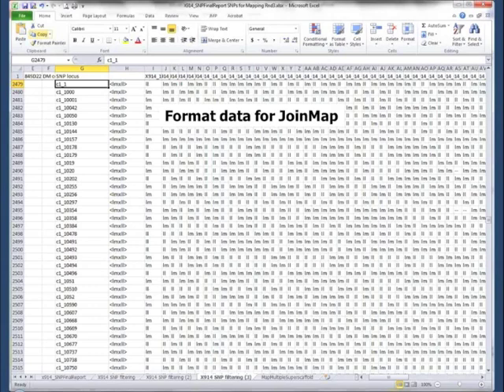You have to put the type of segregation you're expecting. In this case, it's LM by LL. That's just something that you work with. And then you have to convert from the SNP calls of A's and B's to these LL versus LM. So just some data manipulation that goes on.